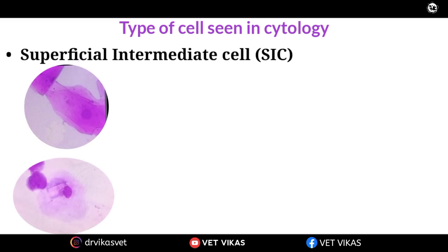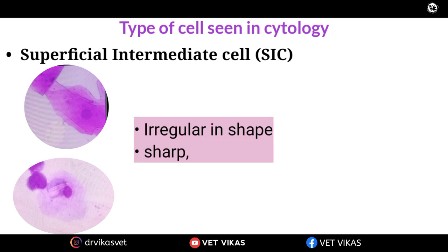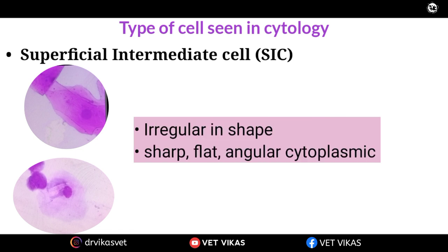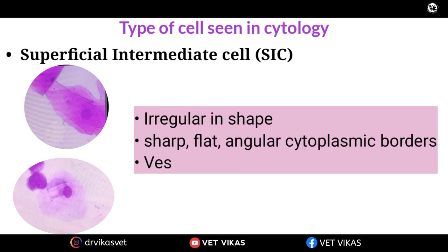The next one is superficial intermediate cell. The superficial intermediate cell is having irregular boundaries; the cytoplasmic border will be flat and angular in case of superficial cells. The nucleus is still vesiculated but the size will be very much smaller as compared to intermediate cell. So this is superficial intermediate.